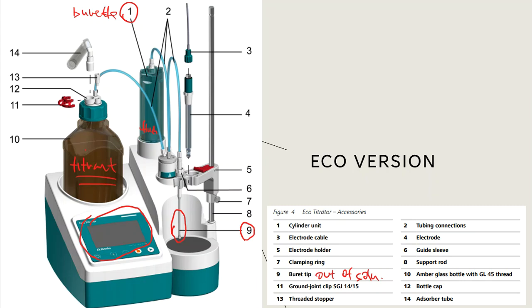So the pH probe has to be submerged into your solution. That's correct. But we often find smoother, better results if we take our burette tip and hold or position it above the surface of the liquid and allow it to drip down into the solution, just like we do when we do a hand titration.